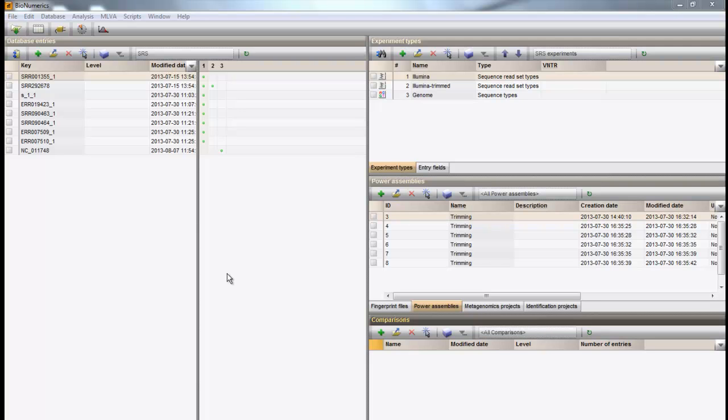The first thing we need is our reference genome. For this example, a reference sequence was downloaded from the NCBI sequence repository. For more information on how to import sequences from online repositories, have a look at our video on the import of sequences from public databases.